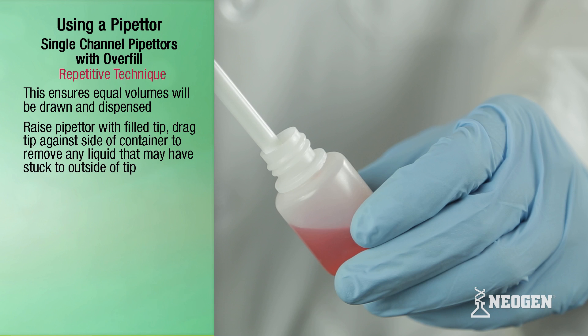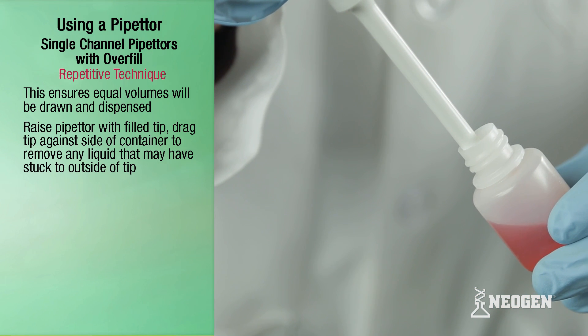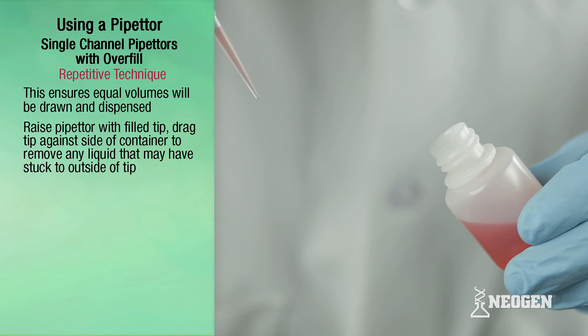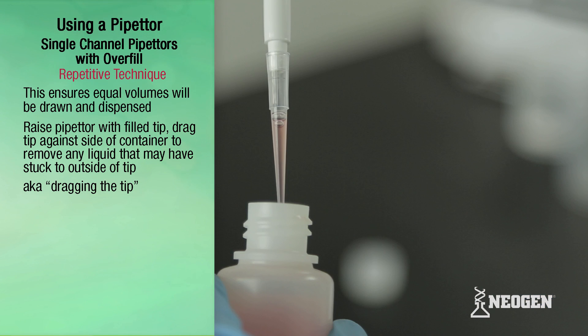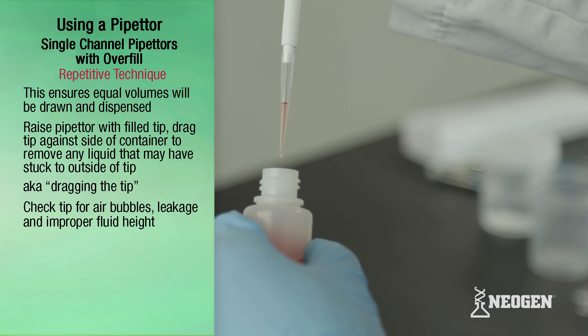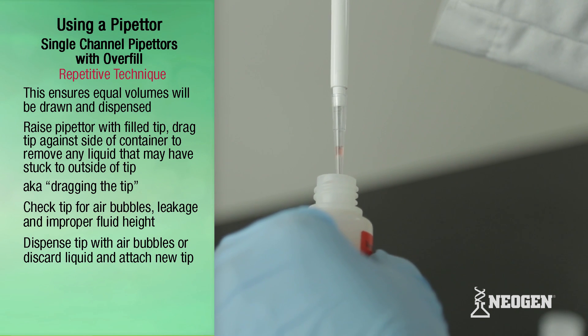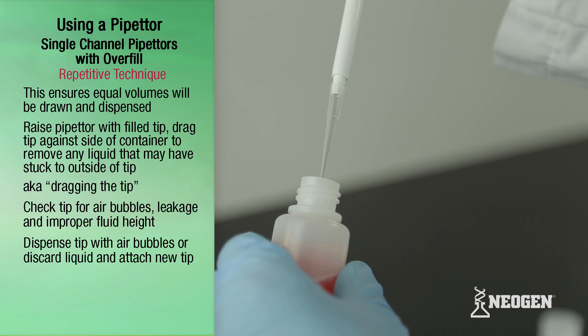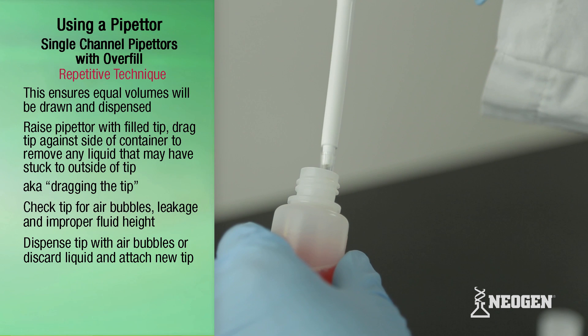Raise the pipetter with the filled tip and drag the tip against the side of the container to remove any liquid that may have stuck to the outside of the tip. This is known as dragging the tip. Check the fluid in the tip for bubbles, leakage, and fluid height. If you see any bubbles, dispense and redraw the liquid following the procedure shown earlier, or dispense the liquid and attach a new tip.